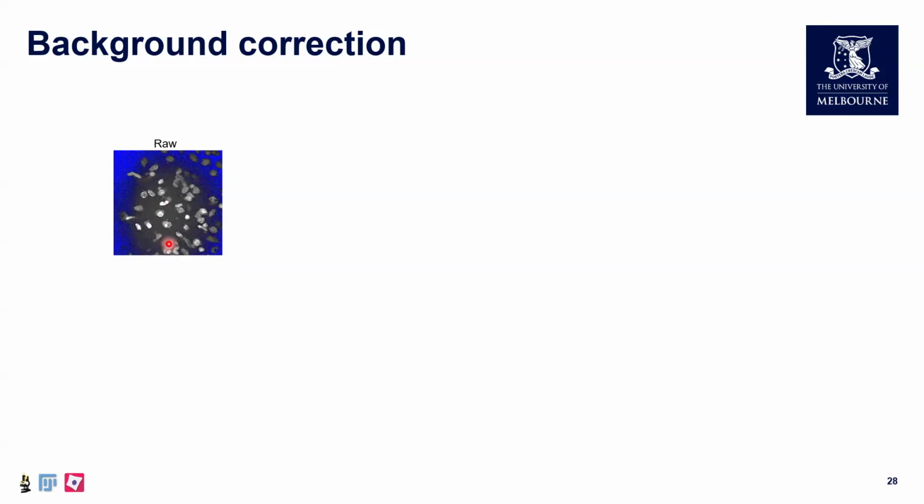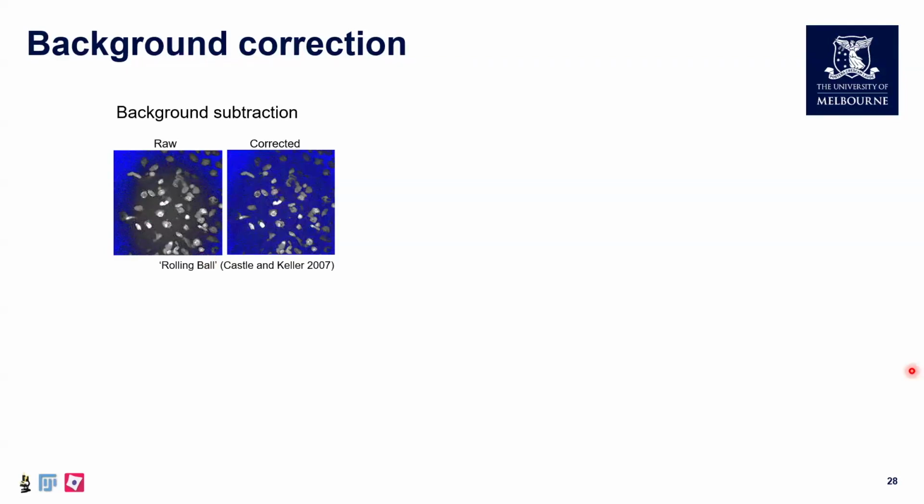But even after you align it, there may be some residual defects. So we still need to correct such unevenness using correction algorithm. Some common correction tool is called rolling ball background subtraction. This method essentially estimates the background as a large ball shape, based on a user-defined value, and subtracts intensity.